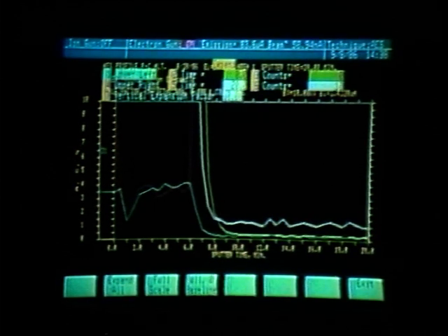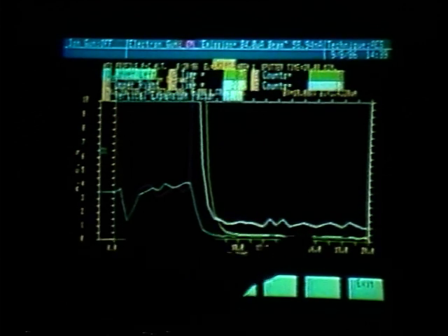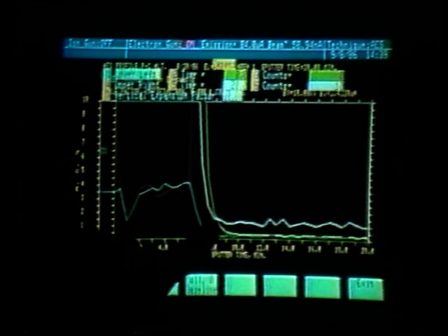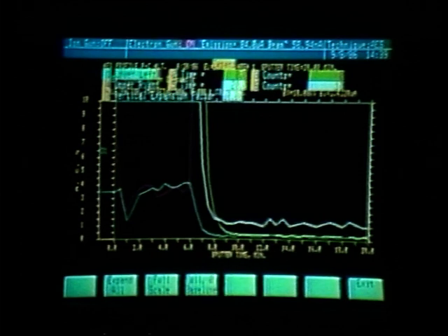We now have displayed on the left graph, we see that it is from 0 to 10%. And we can more easily now evaluate our oxygen peak and the copper, which is in red, oxygen is in blue. And we can also see where the carbon and the chromium has fallen off to a 0 baseline, or essentially no signal once we get into the copper layer.